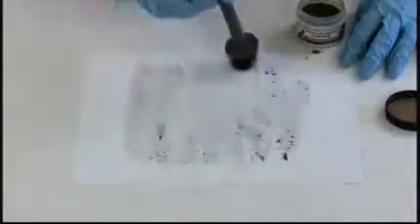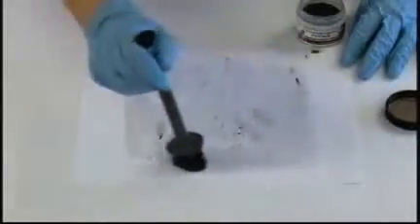ruin your prints. And when you're developing with magnetic powder, you want to remember that magnetic powder is a little bit more abrasive than regular black powder because of the iron in it, and it can actually wear away at the latent print that you're developing. So you want to be careful not to overdevelop and wear away your print. You can see this is developing nicely. And that looks good.